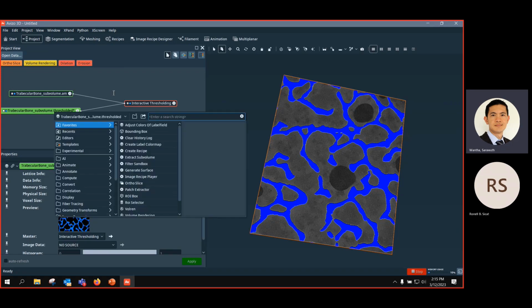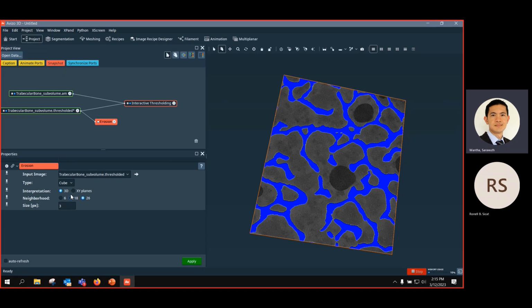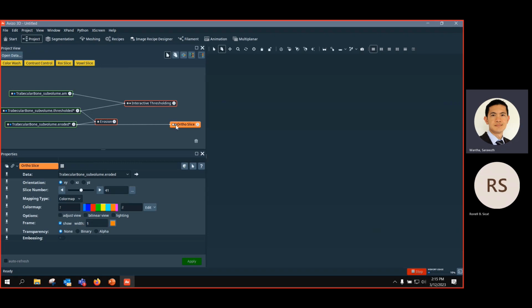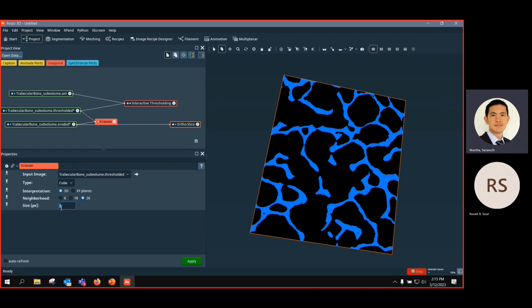So I do erosion followed by dilation again. I do erosion, let's say with a cube, because ball is too much, cube by 1 pixel like this, and then, okay, let's say the result is a cube. So before is here, and then I loaded it, it's been thinned, or maybe more, maybe 3.